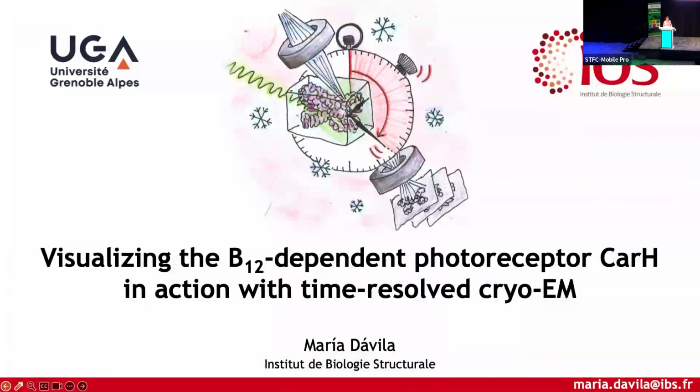I'm a third-year PhD student at IBS in Grenoble, and I'm going to talk a bit about what you said, using time-resolved cryo-EM to study a B12-dependent photoreceptor called CarH.